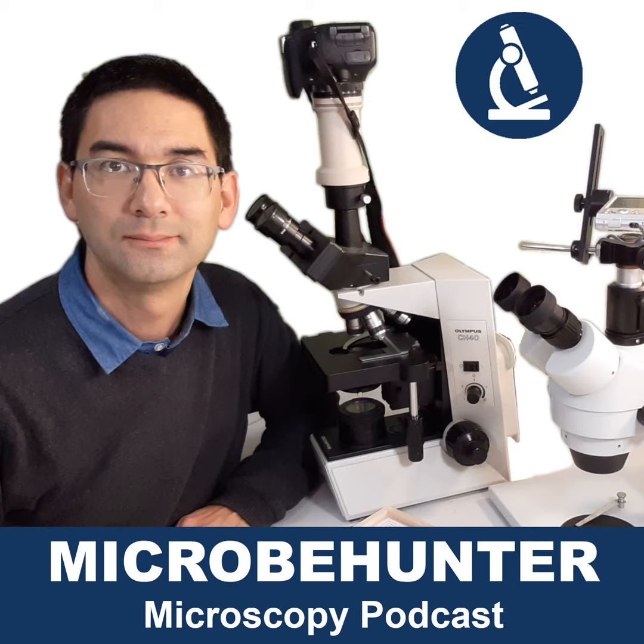A compound microscope, these are those where you use glass slides to look at the objects, okay? And so the specimens already have to be significantly smaller, otherwise you're not able to mount them on a glass slide. And so if you want to look at individual cells and so on, then you have to use a compound microscope, because they magnify much more, okay? Or if you're interested in making the specimen slides yourself, then of course also go for a compound microscope.